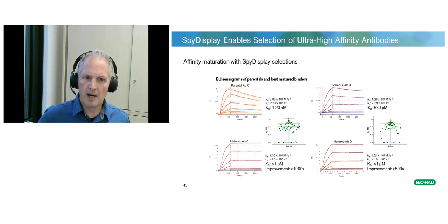In this example, we started with an antibody with an affinity of about 1 nanomolar, and the second example, an antibody with about 600 picomolar affinity. So quite a good affinity already. We exchanged the heavy chain CDR2 and light chain CDR3 separately, so 2 libraries for each antibody. And then did the phage display selection.